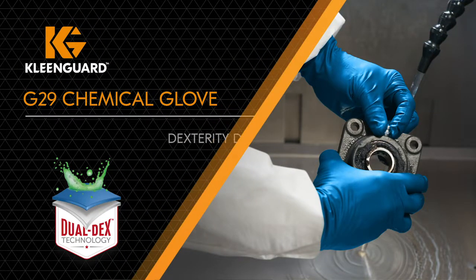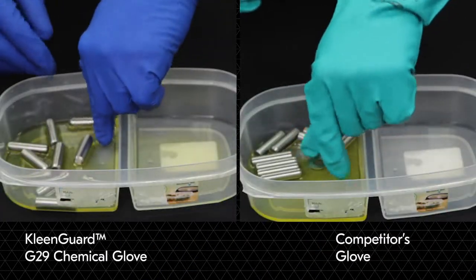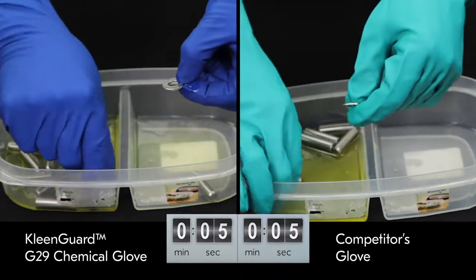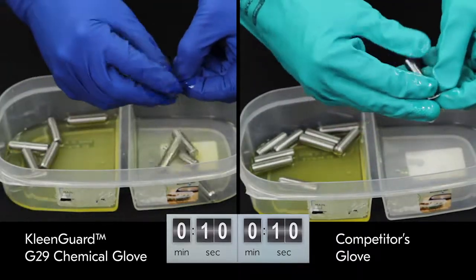Especially when it comes to dexterity. We asked a worker to perform a simple dexterity test using a 15 mil nitrile chemical glove and the G29 Chemical Glove. The chemical resistance for both gloves is comparable for the task.